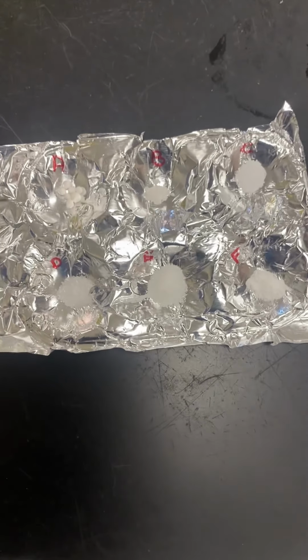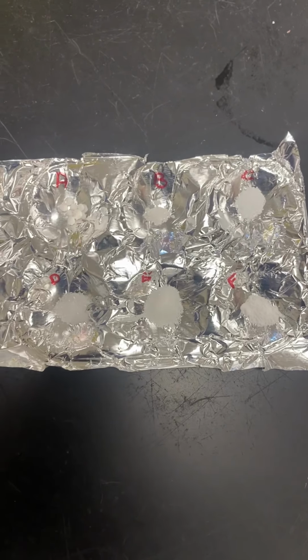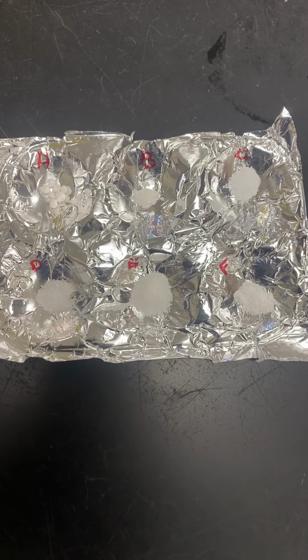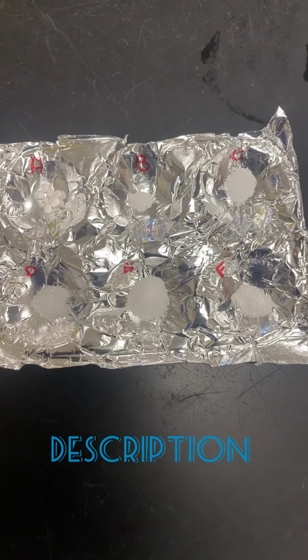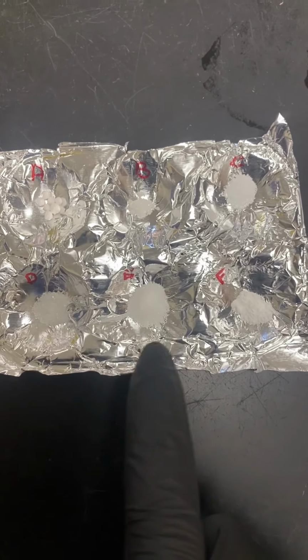Hey guys, you're going to use this video to fill out your data table for the chemical bonding lab. This is the first column and it's the description. So we have sample A, B, C, D, E, and F. Here is sample A. I'm going to zoom in on it for you. That's calcium chloride. Here is sample B. That is potassium iodide.